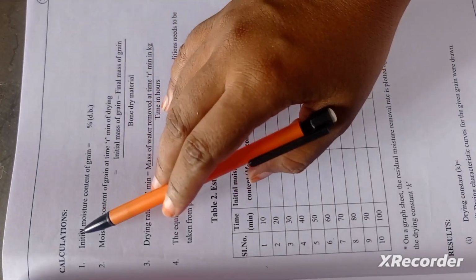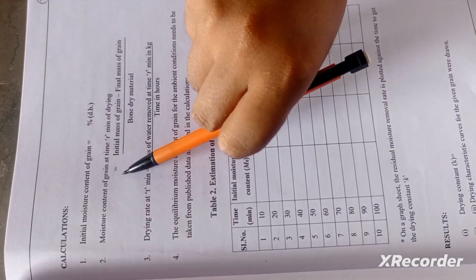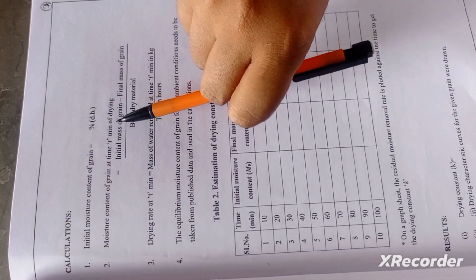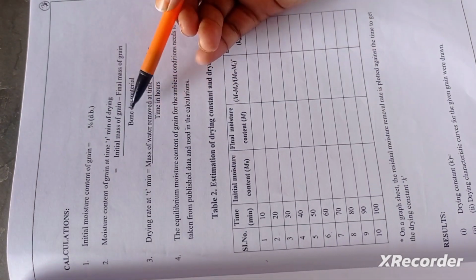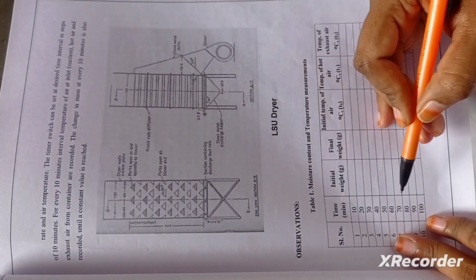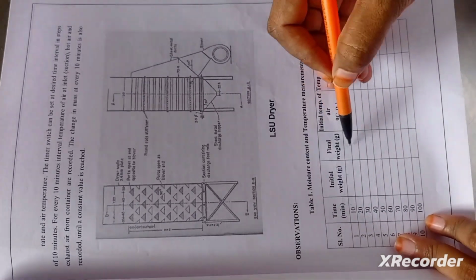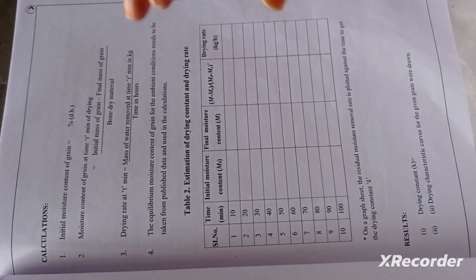First, we can calculate the initial moisture content of the grain. Then, the moisture content of the grain at the time of drying, the initial weight of the grain minus the final weight of the grain. As we already noted down here, we have to wait 10 minutes each time and take the weight of the samples. After noting this down, from this we can calculate the moisture content at each individual time period.